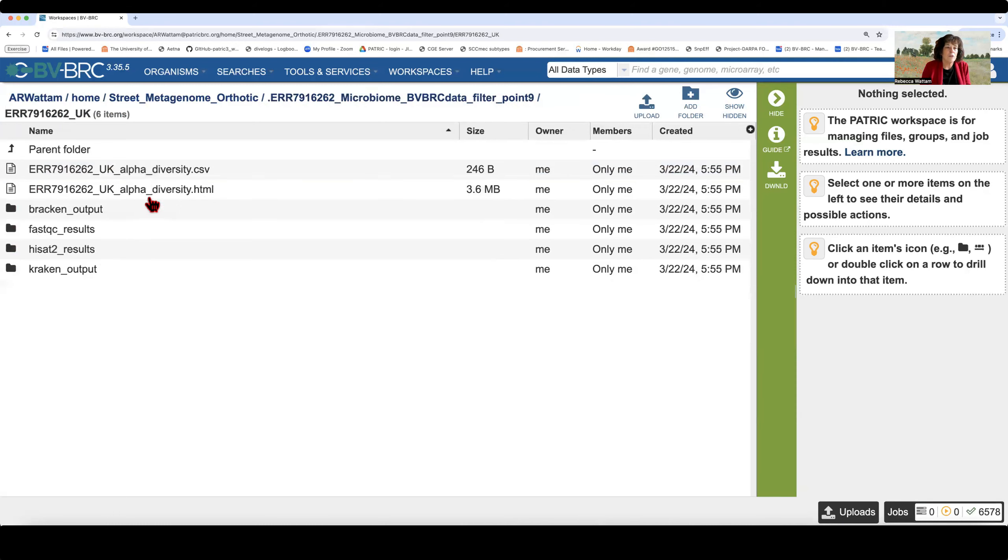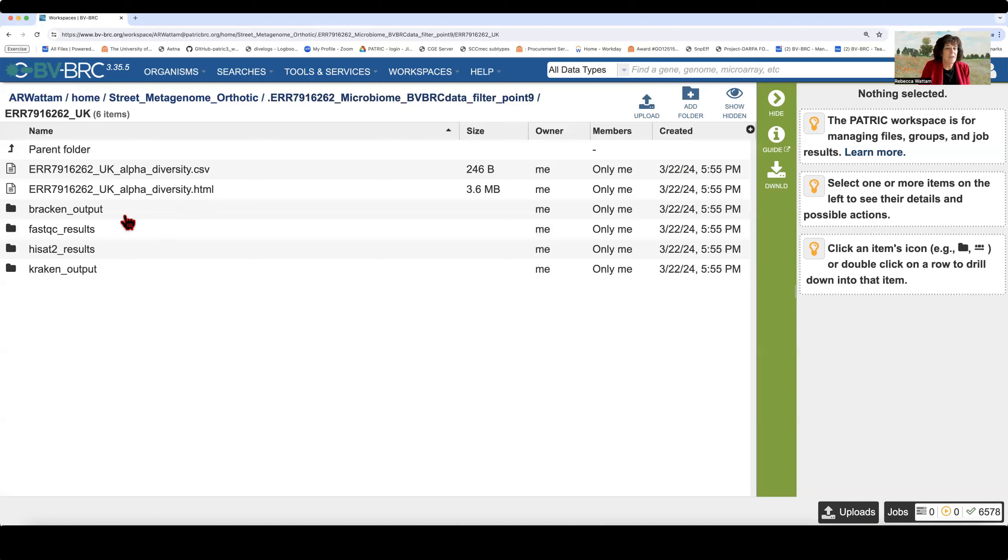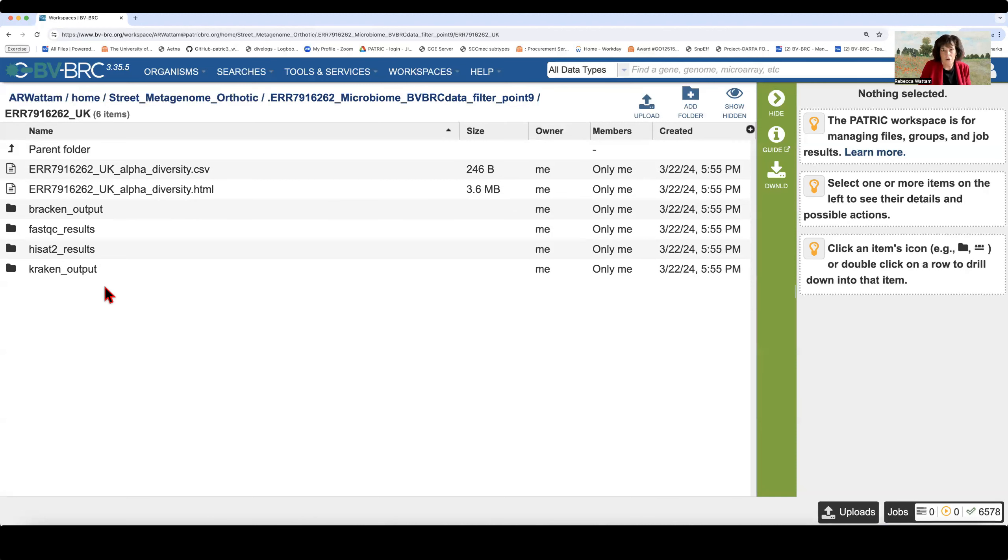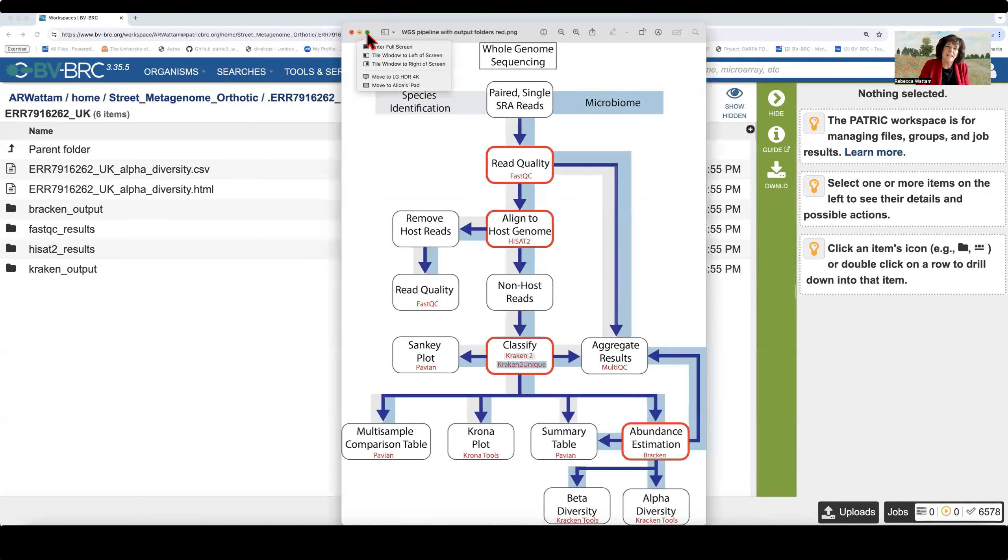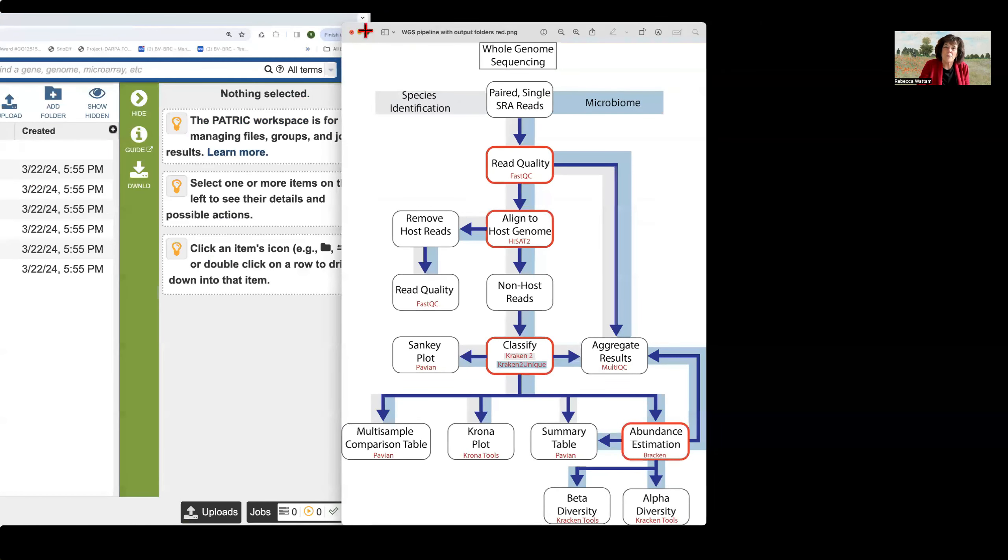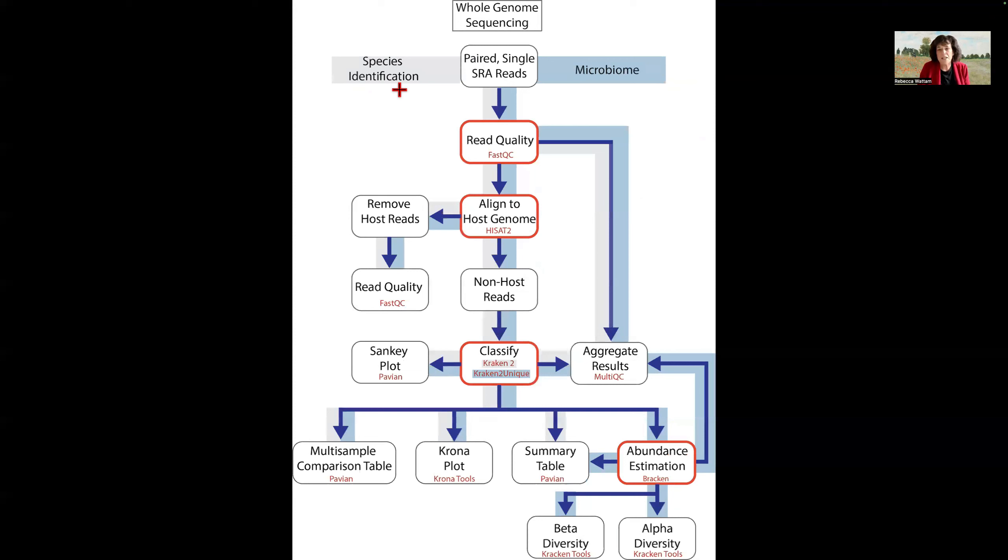But because we only submitted one sample here, these diversity statistics are just for that one sample. And they will look identical to these. So we don't need to go in this right now. But there are these other folders here. So we need to figure out what those are and look at those. So what should we look at first?